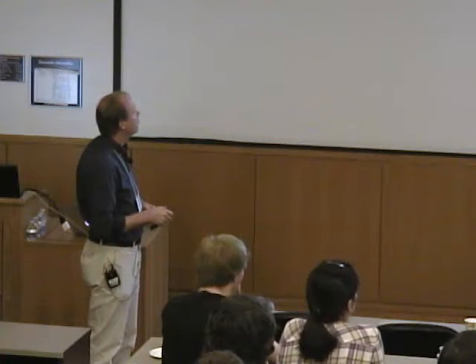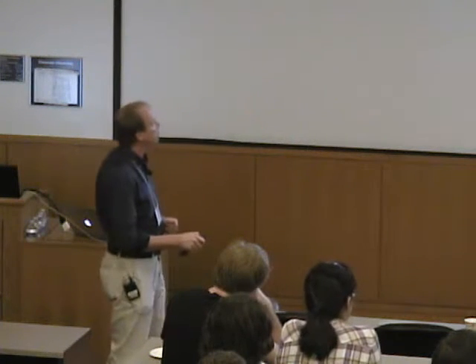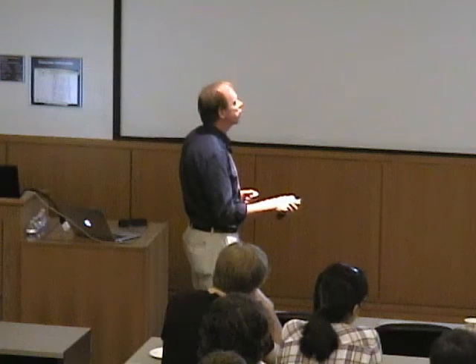Okay, so single crystals are nice, but they're rarely available. And so if I have a solution of my protein or some kind of powder of a solid, then what I get is a random distribution of orientations, and so I get a sum of all of the possible orientations in the sample. And that produces a series of characteristic line shapes depending on what the symmetry of our G tensor is, right? So if all 3 of our G values are the same, then what I will see is just a single line, right? And this will be an isotropic case, and the zero crossing here is the isotropic G value.